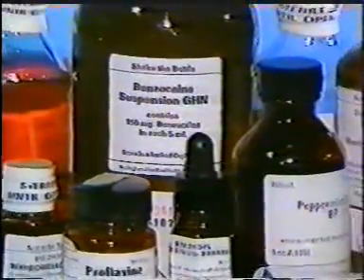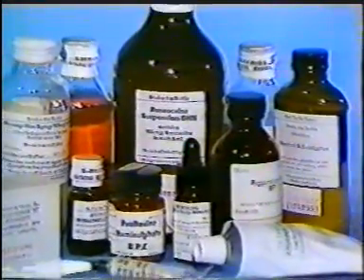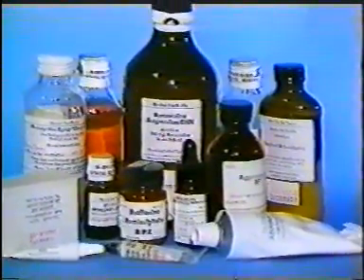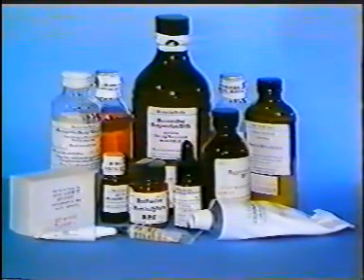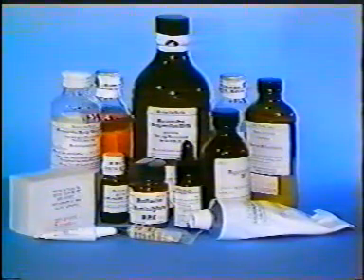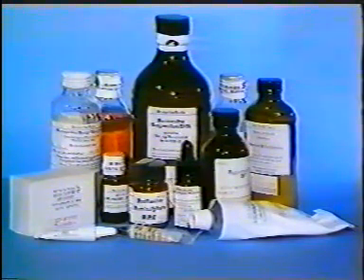Once the product has been prepared in bulk, it is necessary to pack it into the final containers. The type of container to be used will be specified on the batch sheet and must be suitable for the type of product being made. Amber glass may be necessary for light sensitive products, dropper bottles for eye drops, jars or tubes for creams, and so on.